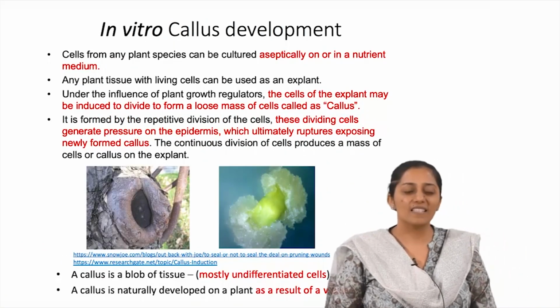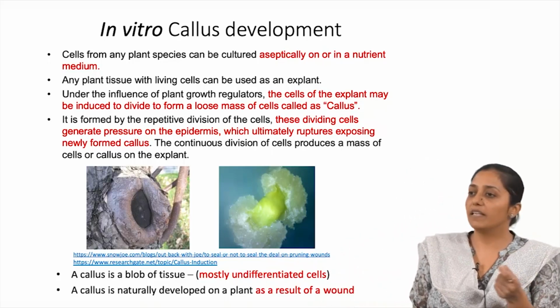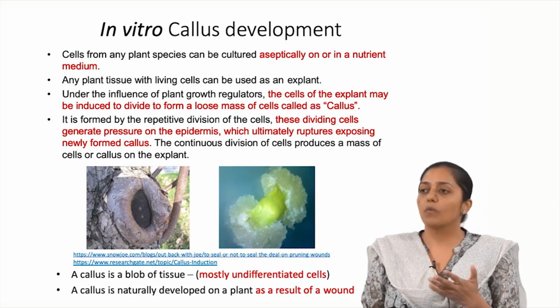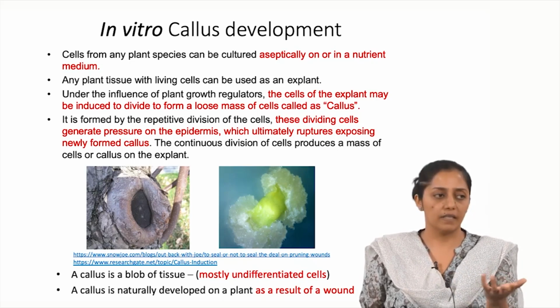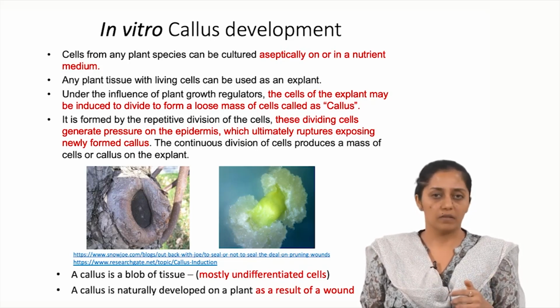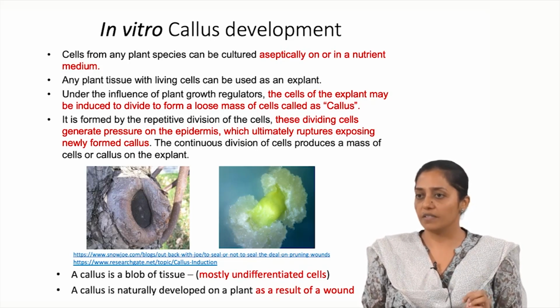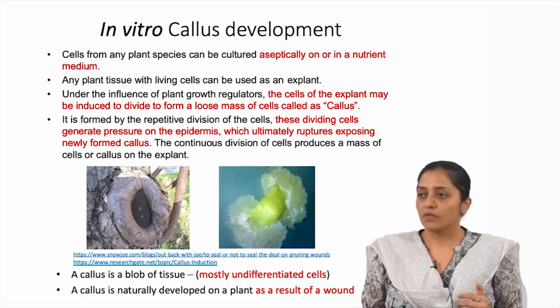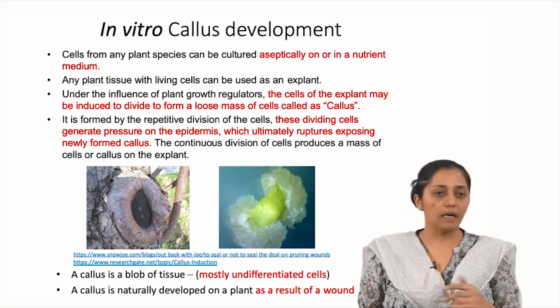Generally, you may see this even when you take small leaf explants and provide the right kind of medium. So the question was, what do you think will become critical in that right kind of medium to reprogram the cells or bring them to dedifferentiated states? It is your hormones. Generally auxins and cytokinins, we will come to that.